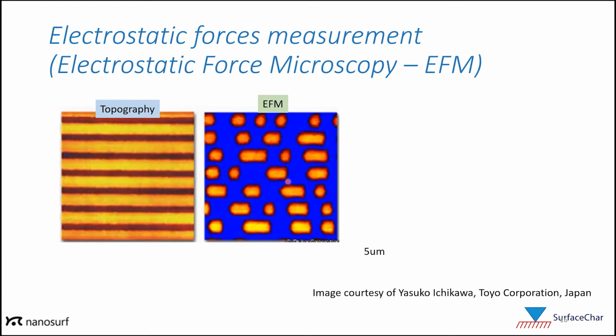It is a convenient method to image qualitative electrical properties, as the electrostatic force is measured between a biased cantilever and the surface as the lever is lifted a prescribed amount in the dual pass mode that I had described previously. This example here is of amorphous bits on a DVD-RW, where we can see the EFM image clearly exposes these foreign bits not seen in the topography image.